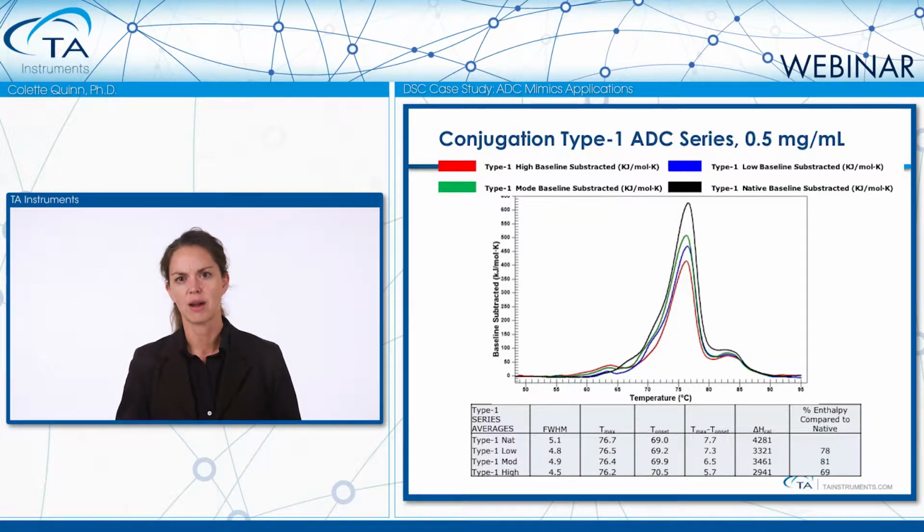So in an antibody, you have the potential for multiple attachment sites. The disulfides are broken down, and the drug is then attached to that disulfide. So you have a possibility of 4 in the CH2 domain, and then you have 1, 2, 3, 4 up in the FAB domain. So you've got those 2 domains that could possibly be linked with this cytotoxic drug.